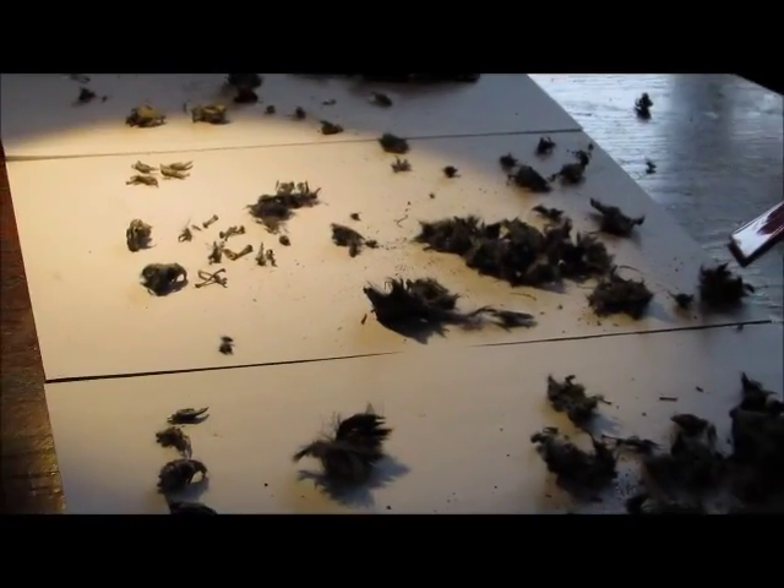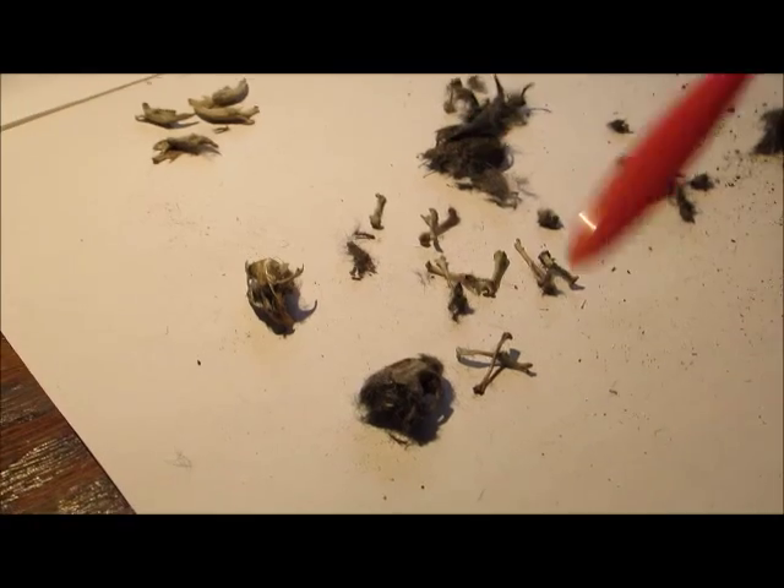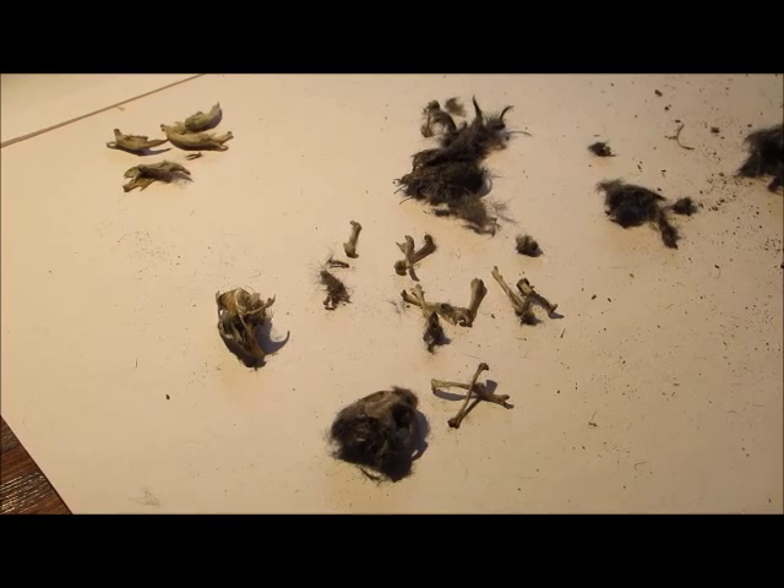I'm about halfway through the dissection, and I've found loads and loads of things — skulls, jawbones, bones, all that sort of thing. So I'll get these cleaned up and I'll come back to it later.